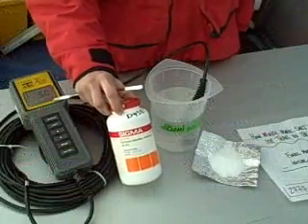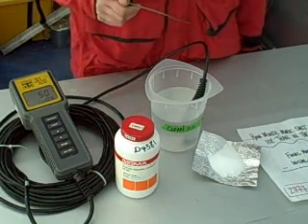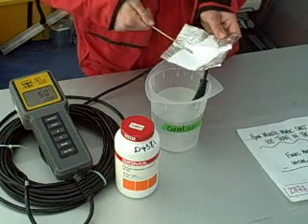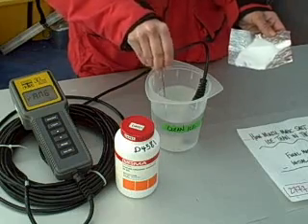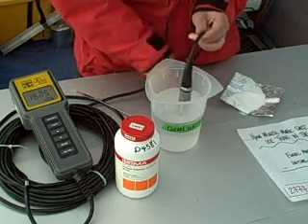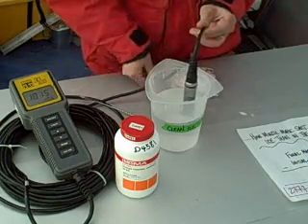The next step in our experiment is to slowly add sodium chloride, salt, to our clean ice solution until the conductivity meter reaches somewhere around 2,777. So we're going to slowly add this and stir. So now we're up to about 1,100, so I'll add a little bit more. And then stir it.